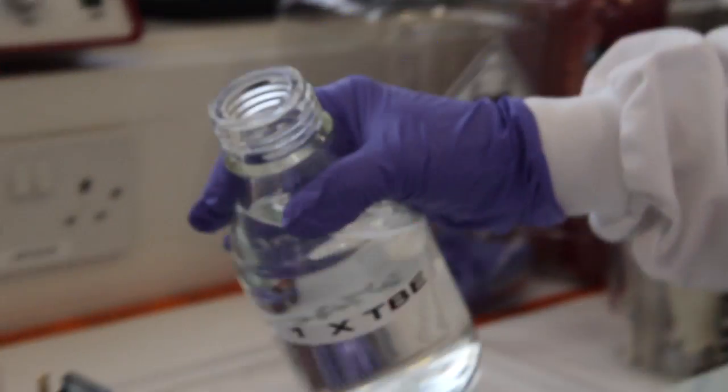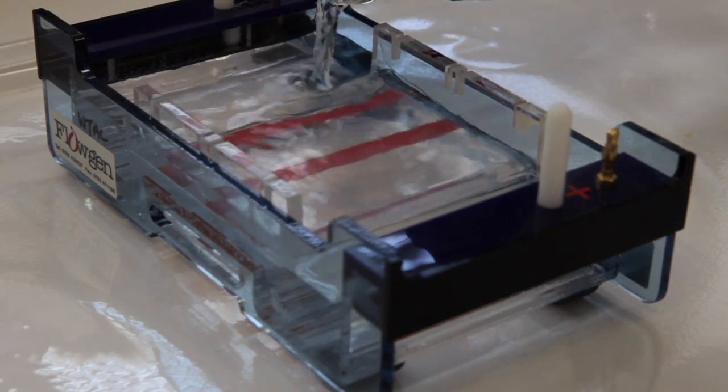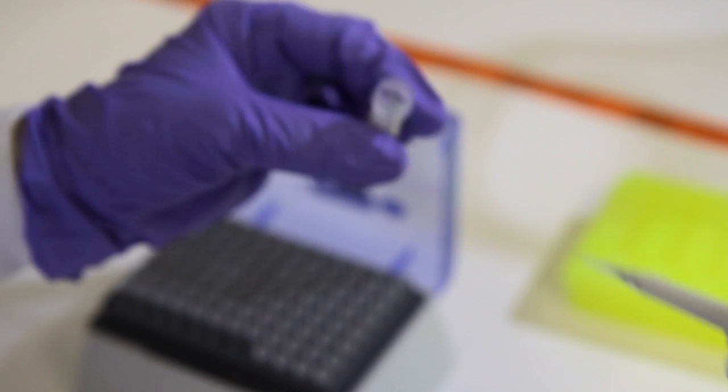Pour the 1x buffer into the gel tank to cover the gel by a few millimeters. You can load your gel from tubes or from parafilm depending on the dye you use.